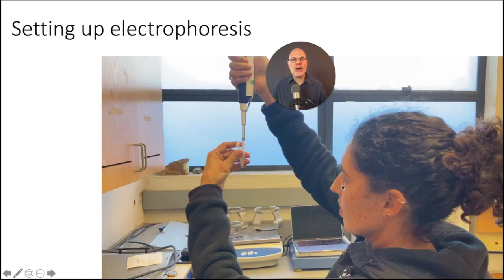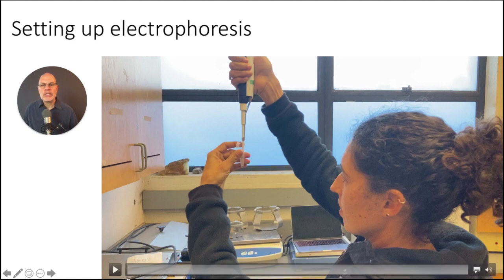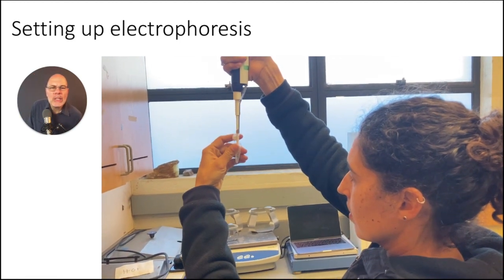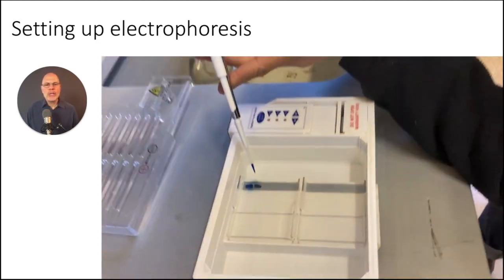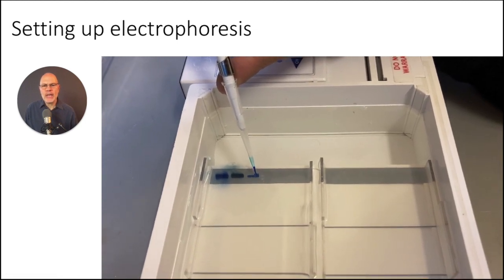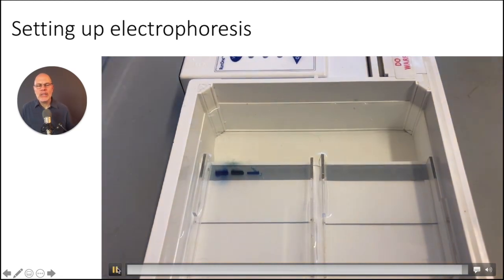And what we're going to see now is Colleen go ahead and do that. So let's get this to happen. Here it is. Colleen is putting a tiny bit of ink into this. She's pulling it out of that microfuge tube, and she's now loading ink into one of the three wells of this electrophoresis setup. I just want to point out that she's previously done that over here and over here. We're just showing the last one. This is the tip of the micropipette, and so now it's set to go.